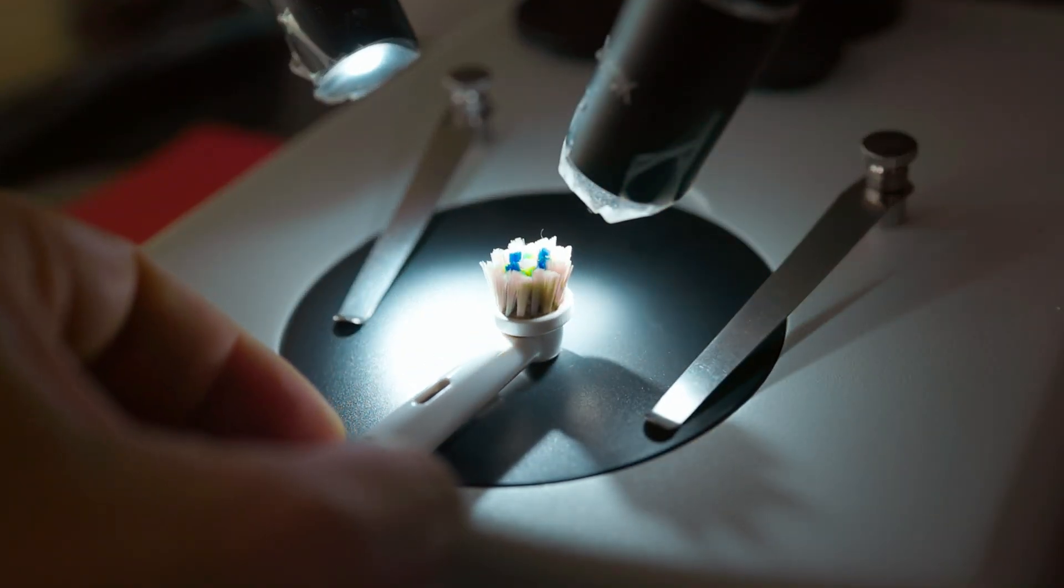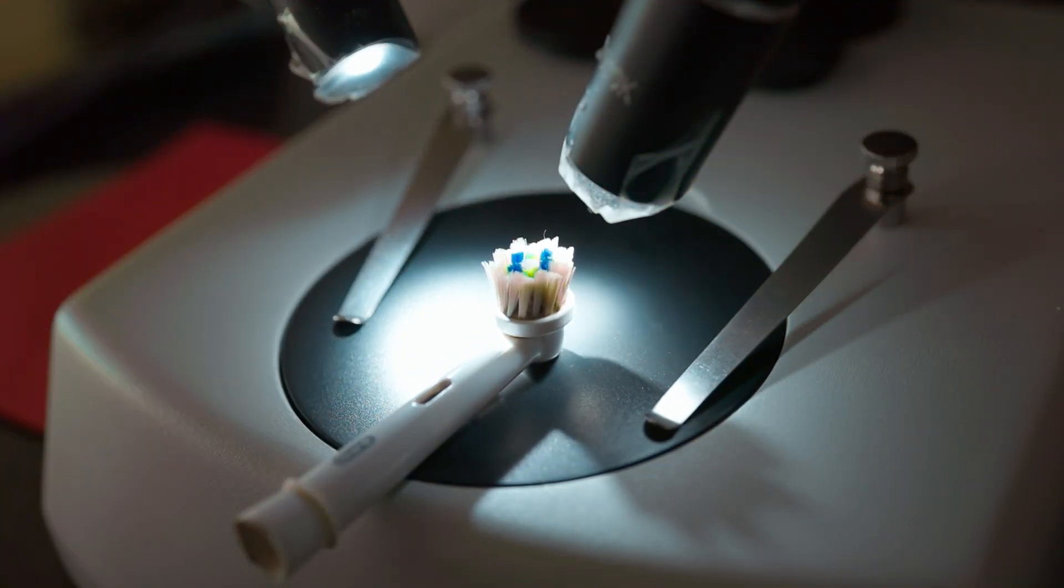Now let's look at the 270 day old toothbrush head. The brushing plane still exists, which is a good thing because it shows the quality of the brush. The problem is the roots of the toothbrush. Let's break it down.